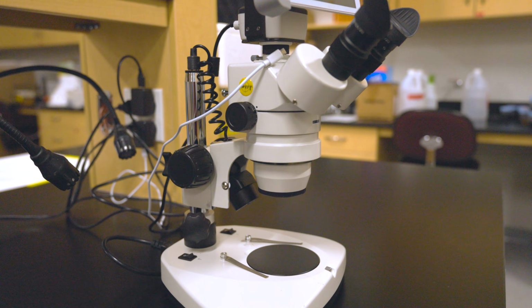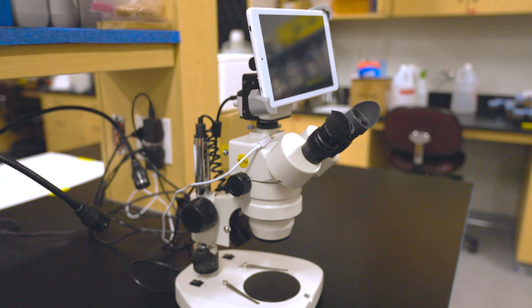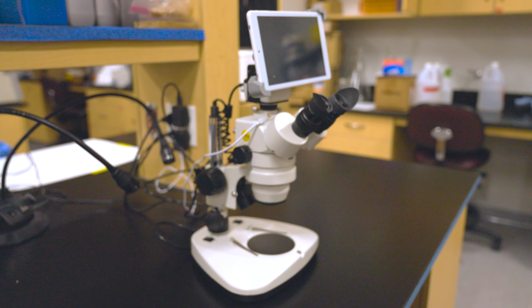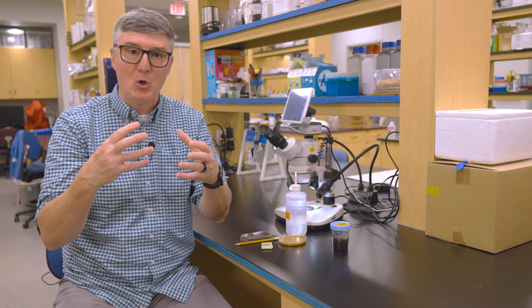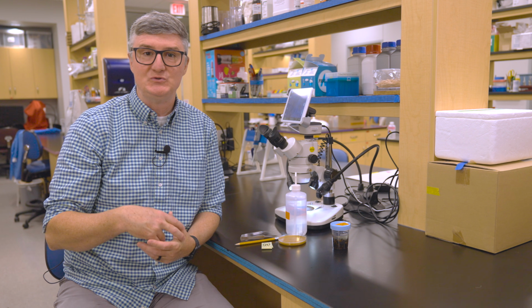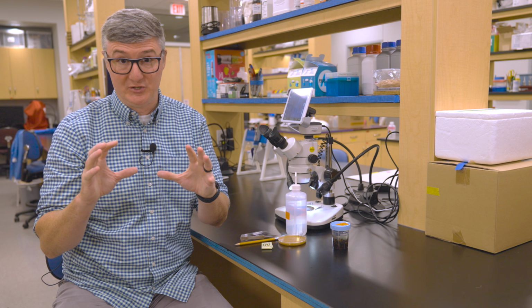This is a dissecting microscope that's supposed to give you fine resolution of larger items, things that you want to just have a look at under the microscope. So we're not putting bees onto glass slides like you might have learned in grade school. Instead, we're wanting to look at the whole body of the bee, and a dissecting microscope like this that gives you 10, 20, 30, up to 50 magnification is a really good start.